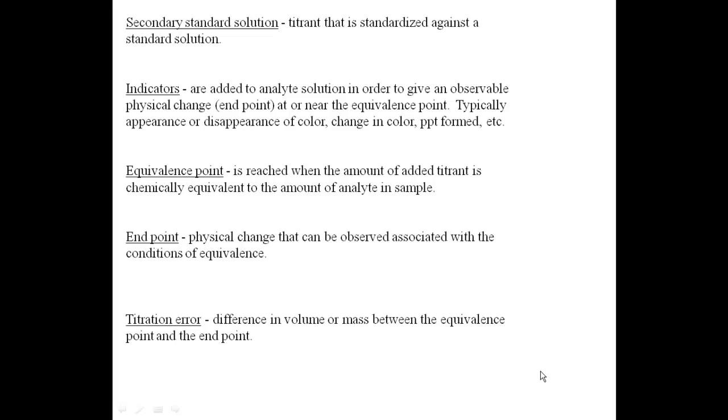Your goal when you're doing a titration is to get that color change to be like one drop past the equivalence point. So you want to get a very faint color that's persistent for 30 or 60 seconds after you add that one drop to the analyte. You don't want to have a lot. You don't go past it too far. You want to just see where that one drop difference is, where we change colors from colorless to some color if you use an indicator that changes the color.